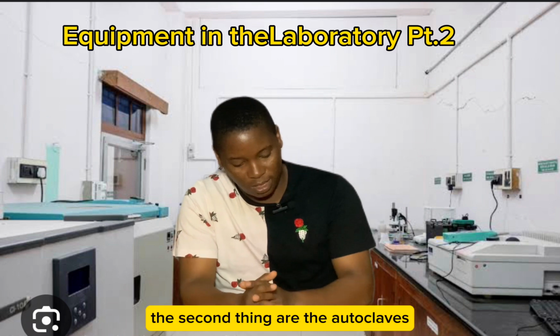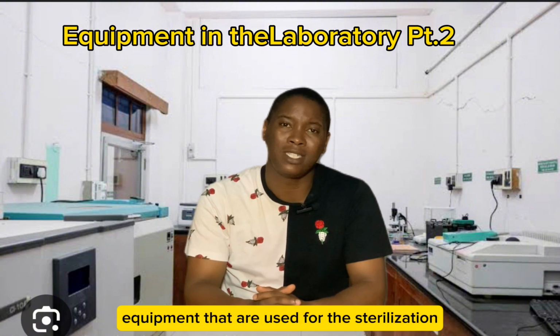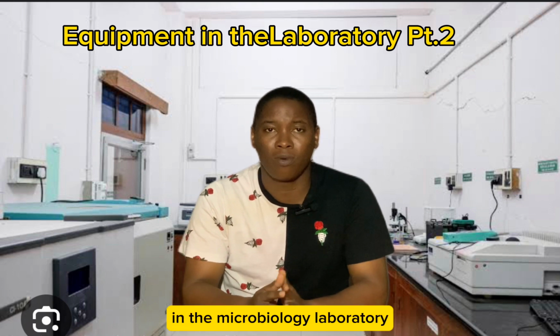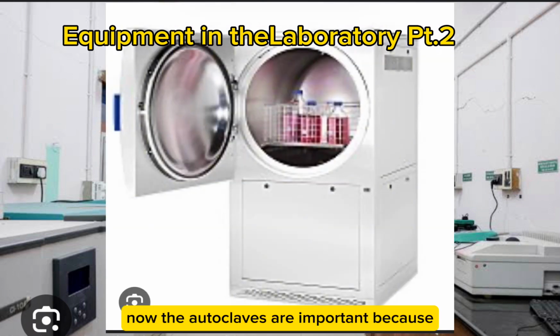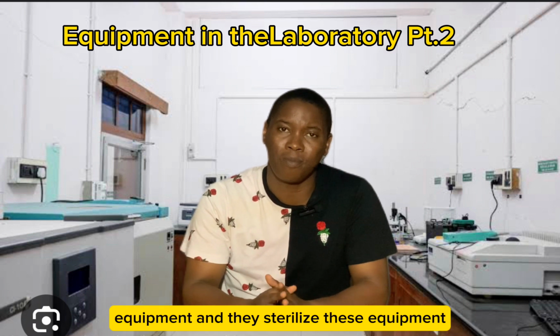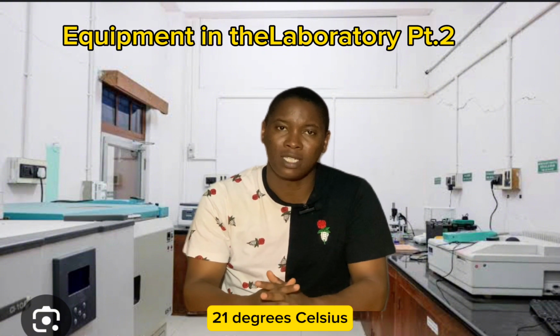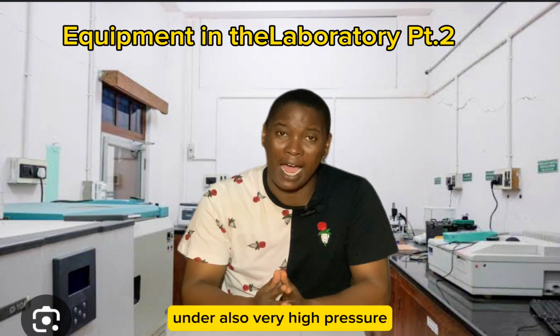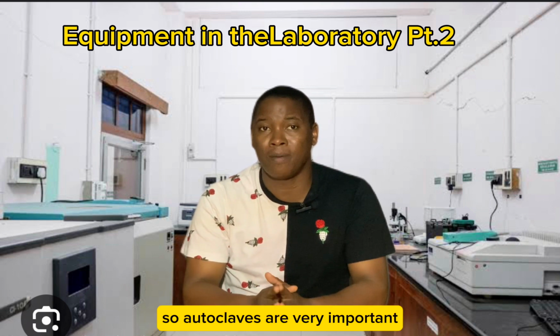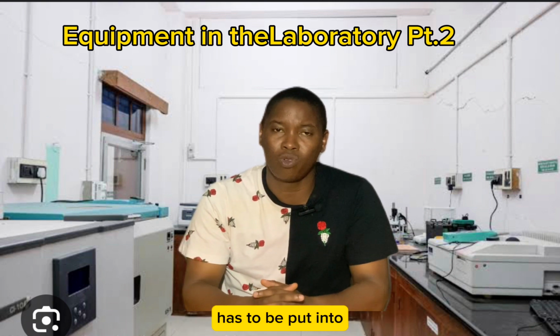Now we have the incubator. The second thing are the autoclaves. Autoclaves are important because they are equipments used for the sterilization of different kinds of materials and equipments used in the microbiology laboratory. They sterilize these equipments at very high temperatures, about 121 degrees Celsius, and under very high pressure, about 103 kilopascals. So autoclaves are very important. Any equipment that needs to be sterilized has to be put into an autoclave.